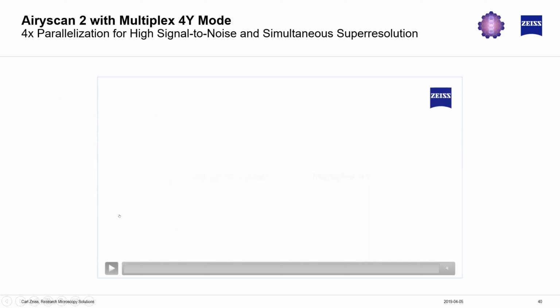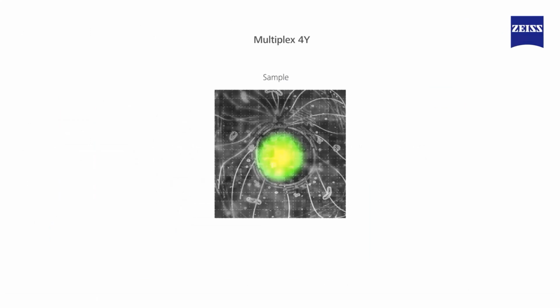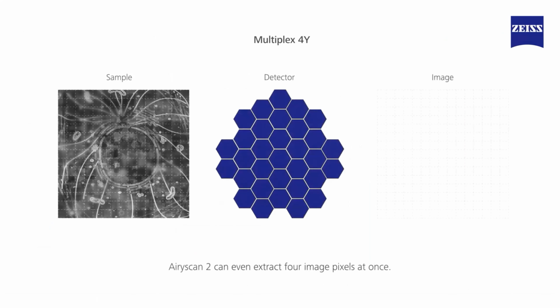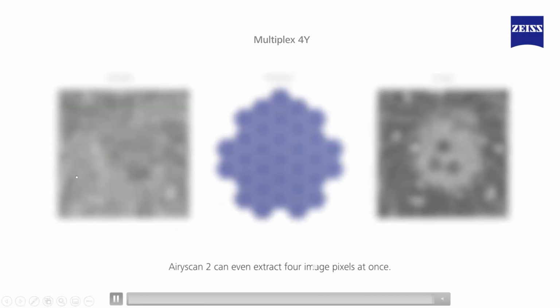The other way that we can use Airyscan is to do multiplexing. And so for anyone who is on the 880, you might remember Airyscan fast. And basically by doing the calculations and by learning how to do fast, we were able to apply this kind of technique not only to the confocal when we shape the laser, but we can even just use the regular point source and we can actually figure it out that way as well.